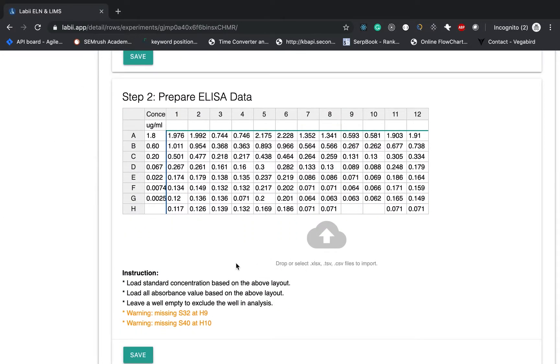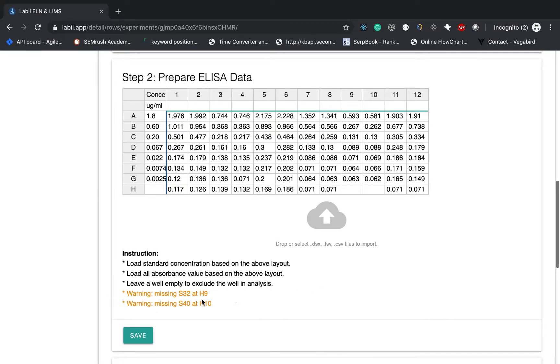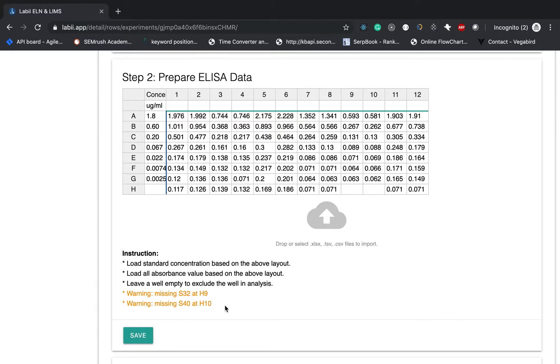And I want to mention you can leave some blanks as empty. Leave a well empty to exclude the well in the data analysis. Also will give you some warnings message over here.